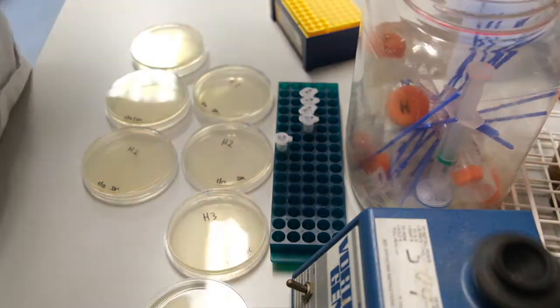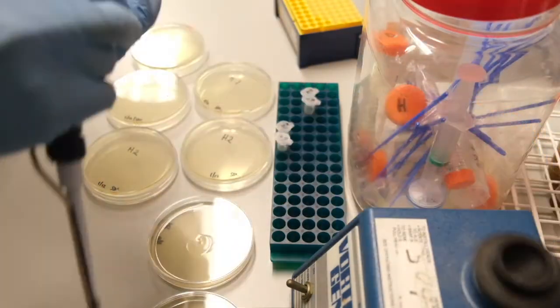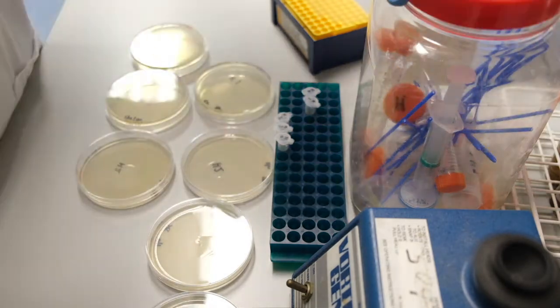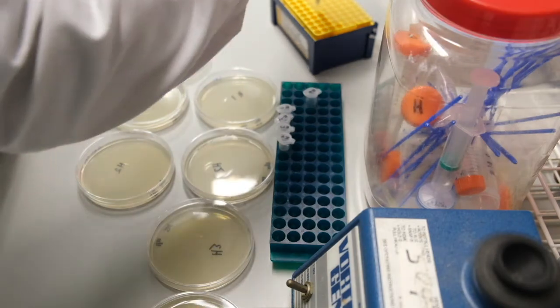In this speeded up footage, I pipette and then spread soil sample H dilutions onto GAUSE number two plates, both with nalidixic acid and without nalidixic acid.